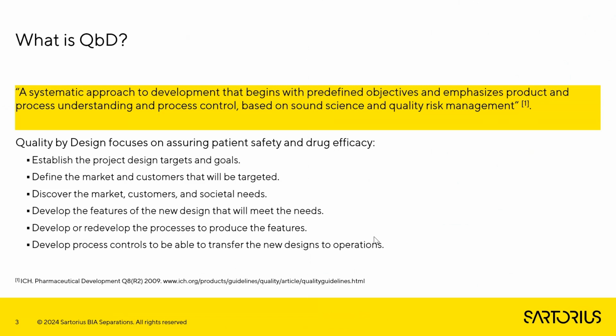So it's development that begins with predefined objectives and emphasizes product and process understanding and control. And this may be slightly different from how we were taught to conduct experiments in university still, because it really puts the end in mind from the very beginning.